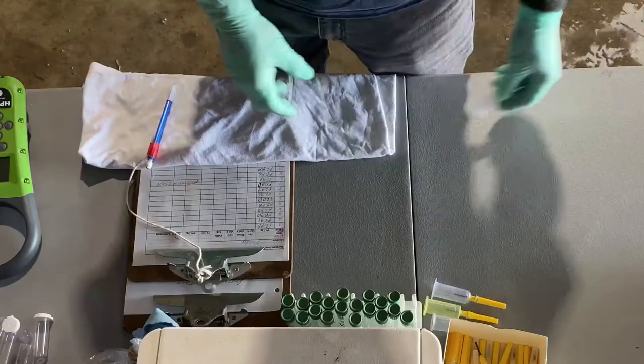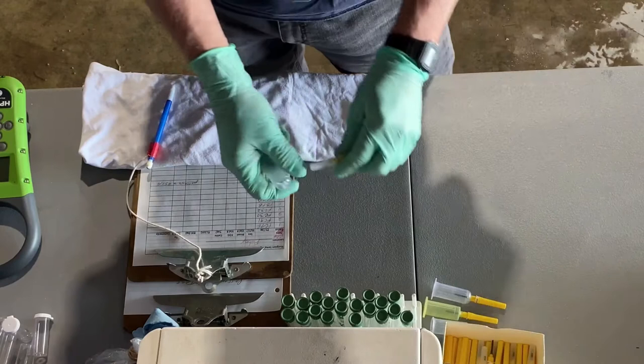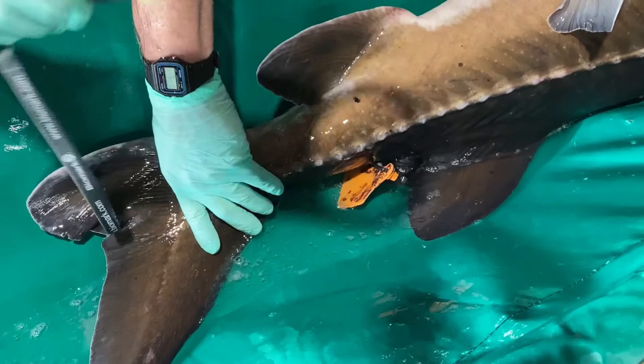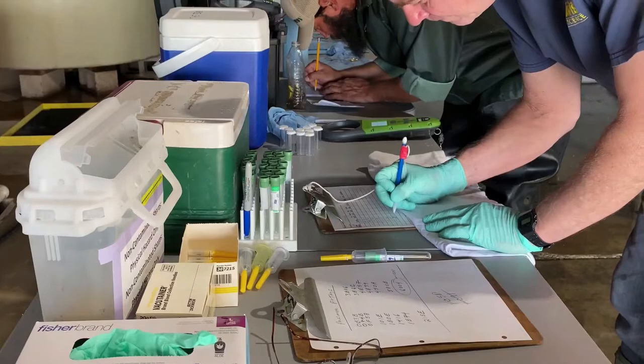The blood vacutainers you see here are 10 milliliters, but a smaller 5 milliliter vacutainer can also be used. Broodstock are usually given an external tag identifier, like this yellow cattle tag, and also an internal pit tag which requires a scanner to read the ID number for the fish.